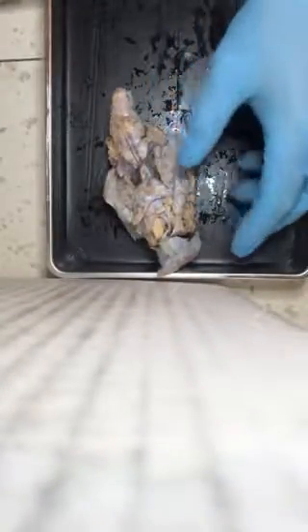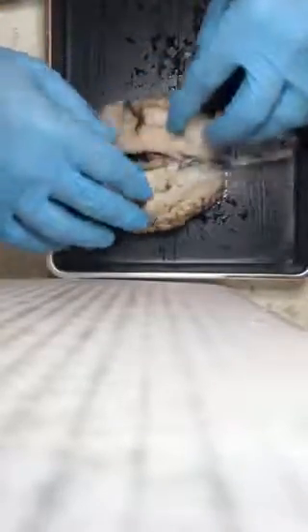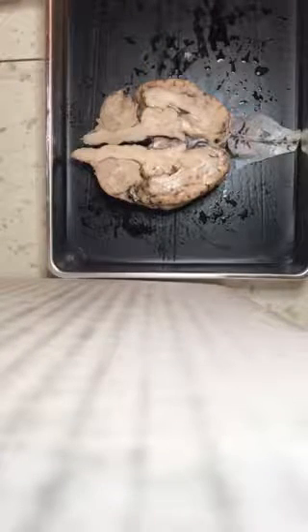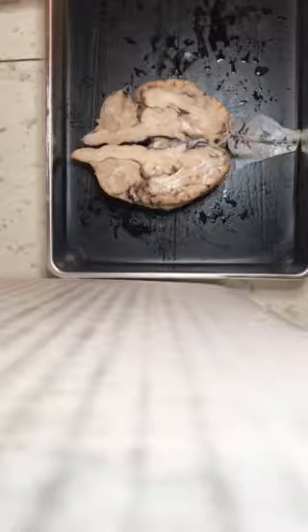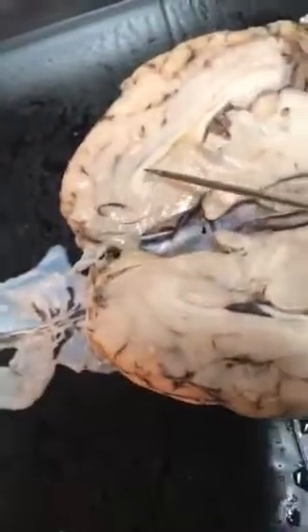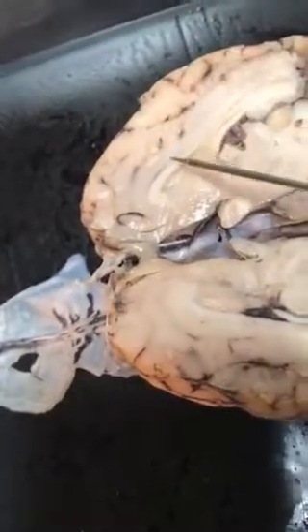Okie dokie. All right, so the mid-sagittal section, which I already have dissected. So this is the mid-sagittal section. All right, so the corpus callosum is right here. So this is the corpus callosum along here.